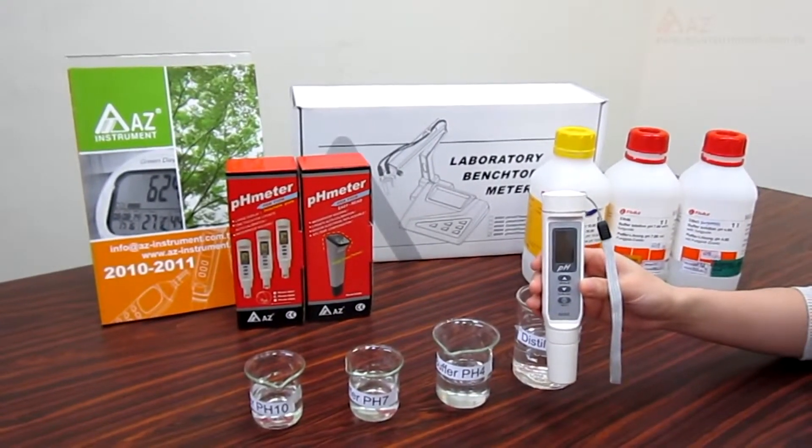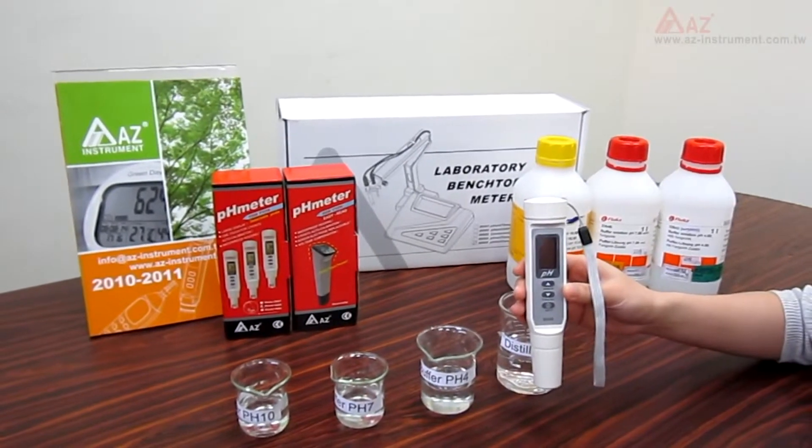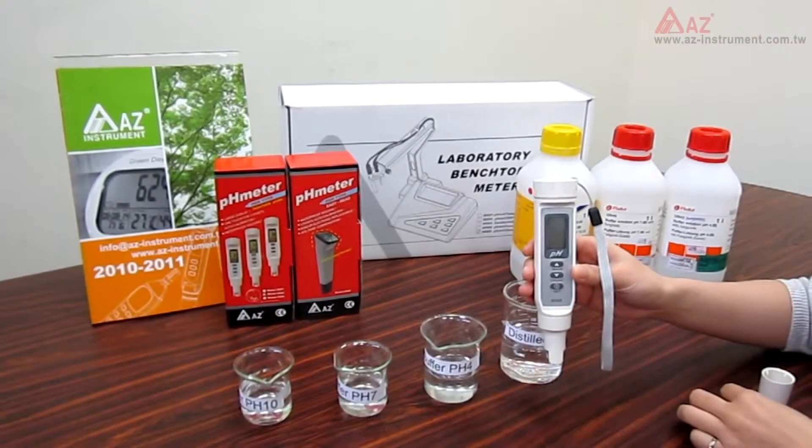In this video, I'm going to show you how to calibrate the AZ-A688 pH meter. This meter features automatic calibration. Users can easily do it in a few minutes.